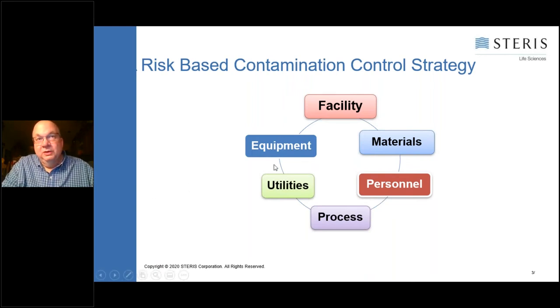And then we have equipment. So anytime you place new equipment or existing equipment in a clean room, it can potentially be a source of things like bacillus or mold. And especially where you place it can affect contamination in a clean room as well. I've seen facilities where if you place the equipment and it's covering an airflow vent where that vent is supposed to be taking the HEPA filtered air and recirculating it in the room, you have to be very careful of that because you could be blocking that airflow pattern.